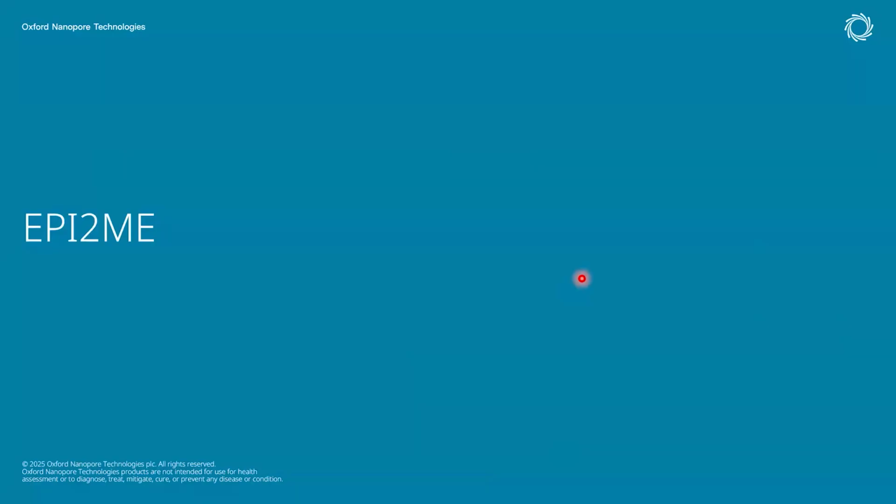So I think that's what I wanted to discuss regarding base calling, and a very brief overview of how the data analysis workflow works with Oxford Nanopore. And I think Matt can give us more ideas about what EPI2ME is and how we can utilize it specifically for the cfDNA context, as that is very important for your work.